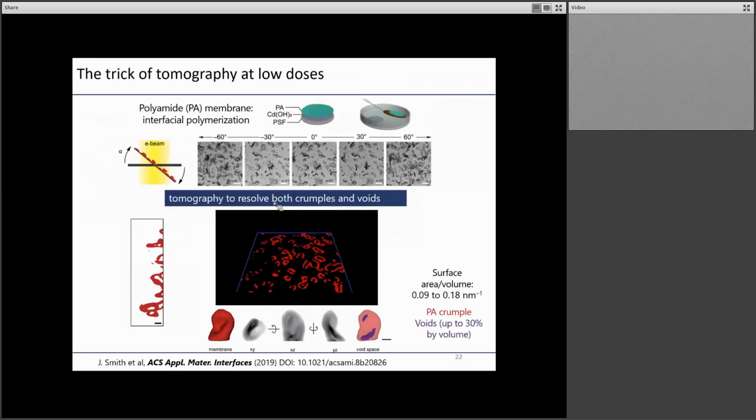Electron beam effect was a battle we fought really hard in our early nanoparticle self-assembly experiments. So we utilized all the lessons we learned and adopted the strategy of low-dose electron tomography. Tomography is a method which can detail a 3D shape by taking a series of 2D projections of different orientations. And clearly, as shown in these TEM images, we didn't drill a hole this time, and we were able to actually achieve 3D reconstruction of the PA film as shown in this movie.